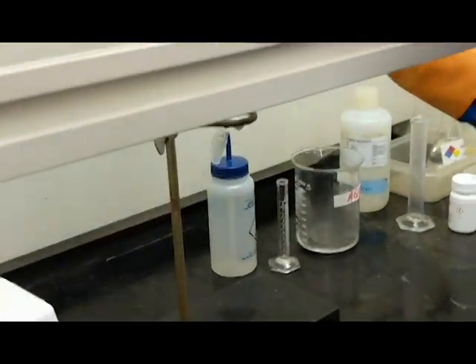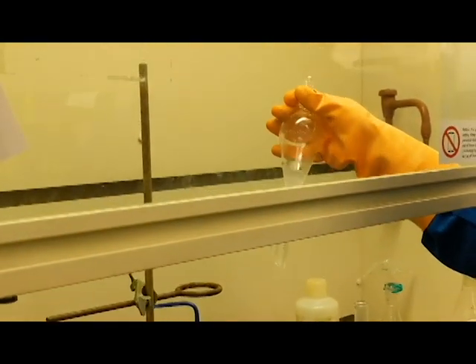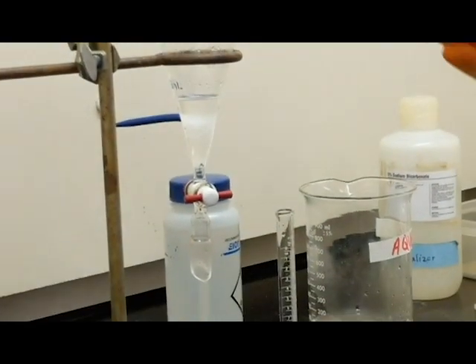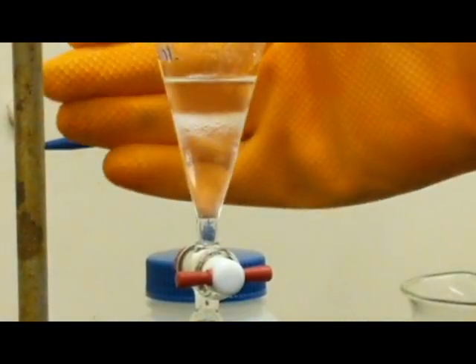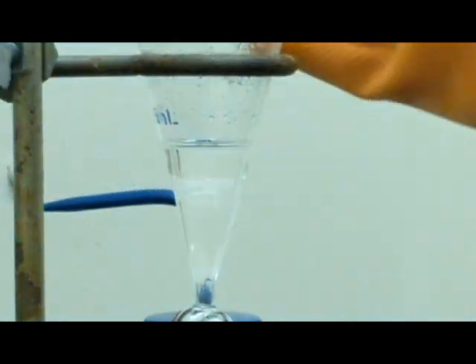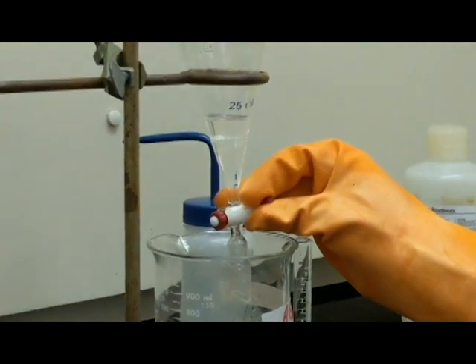So now, I'm going to put my final solution inside the ring stand, but I'm going to kind of agitate the solution around, trying to get those droplets down inside. And I'm going to patiently wait for there to be 2 distinct immiscible layers. You notice that there's bubbling on the inside. You want that bubbling to settle. That is a slight emulsion. It will go away. Take your aqueous wash beaker, put it back underneath, and drain the aqueous layer out.